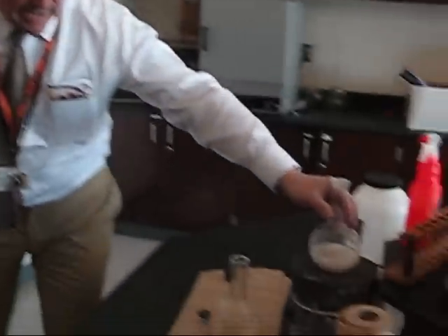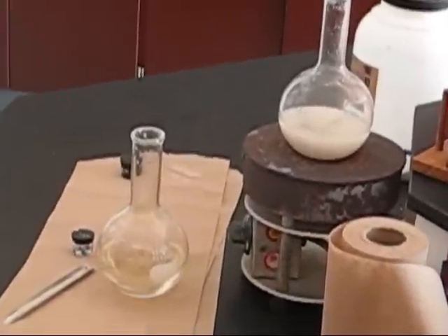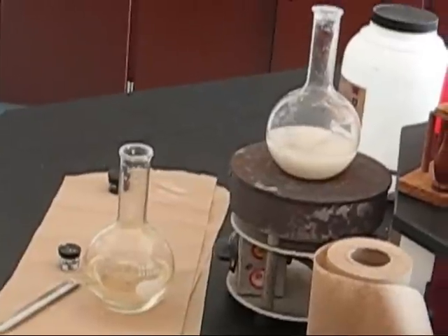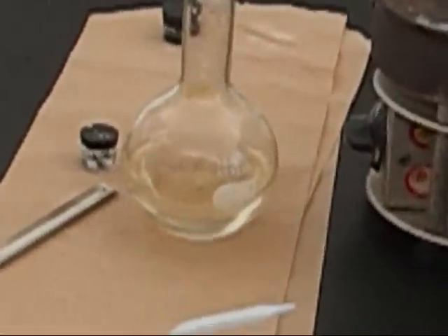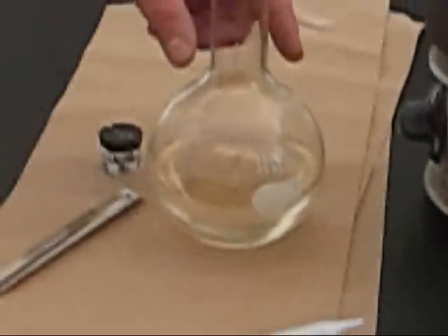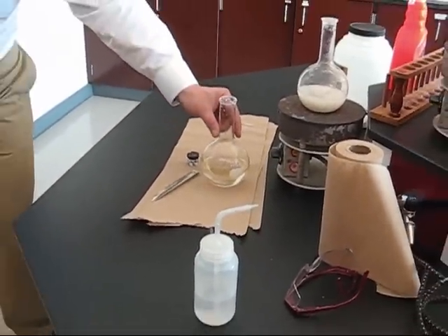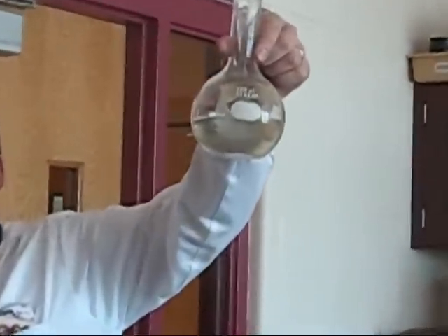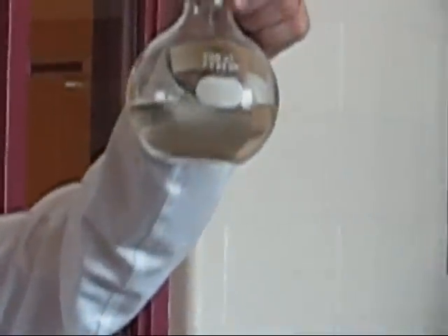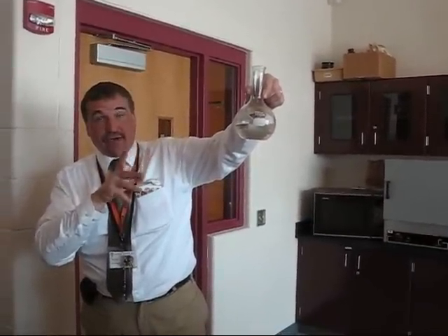What I did was I heated that on a hot plate and it turned into this. I don't want to pick it up because I'm afraid it'll go. It dissolved — I think that's a solution now. It was boiling hot, but now I've slowly, carefully, and undisturbingly left it cool, so it's now entered the forbidden supersaturation zone.